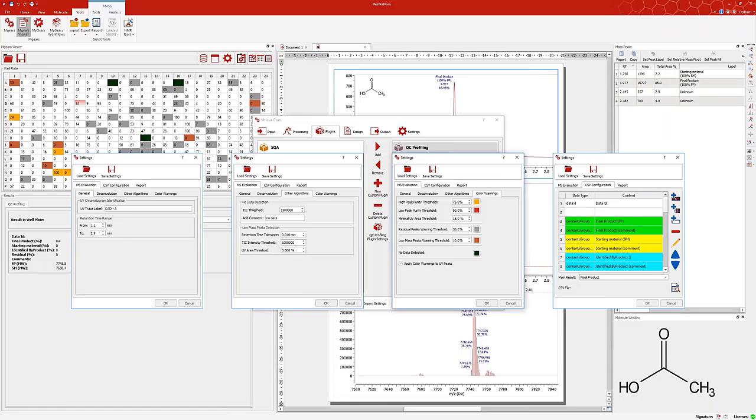In the last little window here, you can define how your input file looks like, and what information your output file should contain. The trick in all these settings is that you can save all the just-mentioned settings and do the same for all different applications you might have.